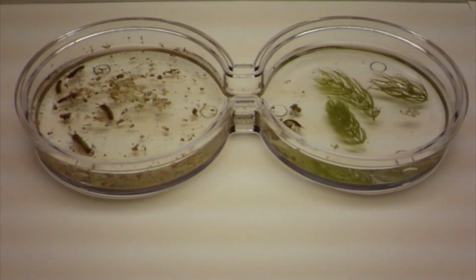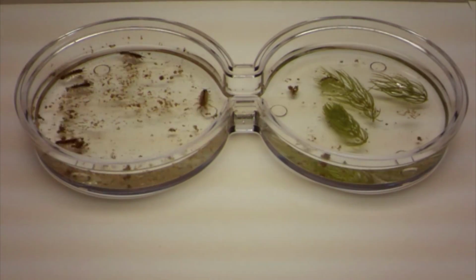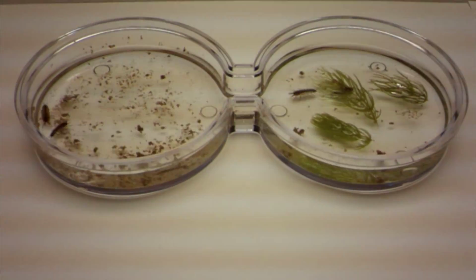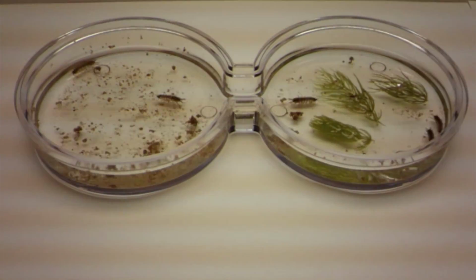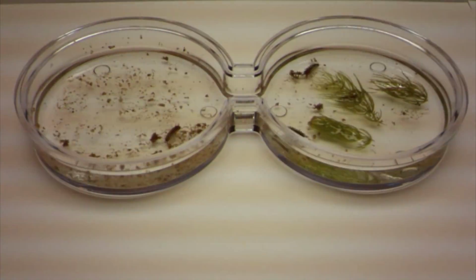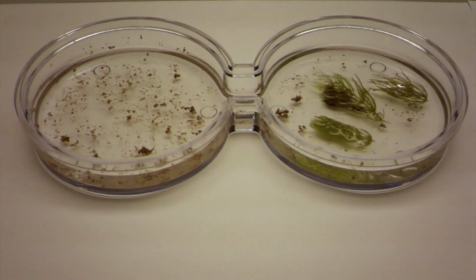The first choice chamber was set up using living plant material on the right side and dried plant material on the left. At first, the aquatic sow bugs spent their time on the left side by the dried plant material. Then they began to explore both sides of the choice chamber, interchanging between the two. In the final moments of the footage, the aquatic sow bugs congregate on and in the living plant material.